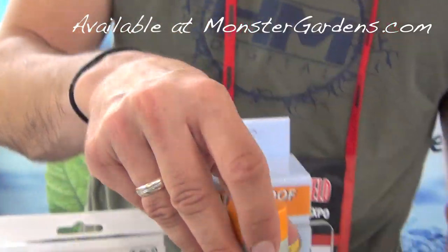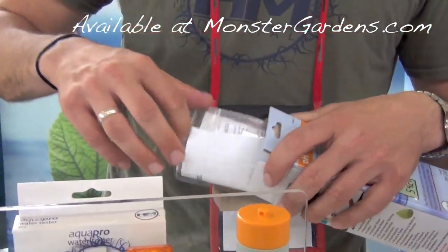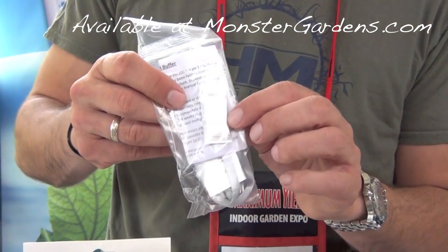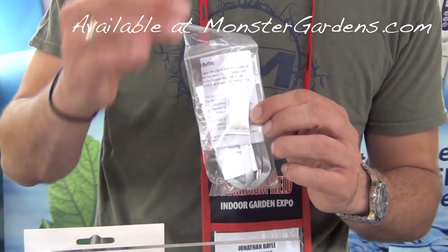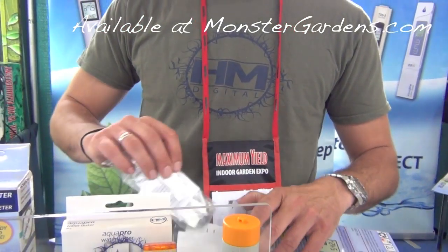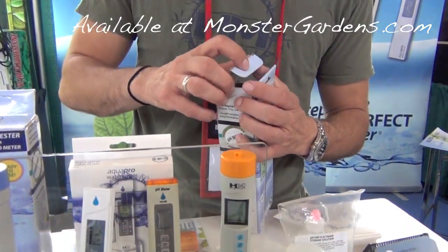It comes with a sponge. And also we include, when you buy a pH 200, a little storage solution and a pH 7 buffer. You need to calibrate it to 7 out of the box. It's a very important thing to do, just to make sure it's set properly, and then you can calibrate it to whatever it is you want to calibrate it at.